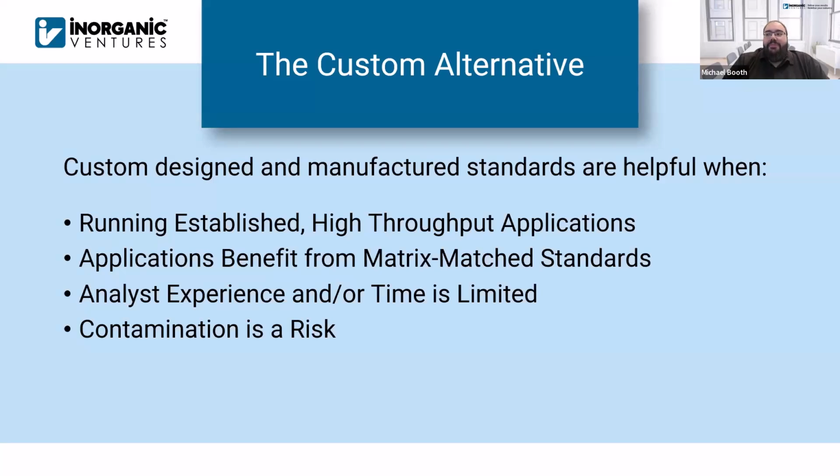Sergey also mentioned matrix matched standards, and this is also extremely important. This is where custom standards can come into play. We can put together standards that are matrix matched to these high concentration elements that might be in your matrix, and we can ensure that those standards are also clean of impurities. So that's really the biggest part. We've talked to a lot of folks that have put together matrix matched standards from stock standards, using maybe a salt or something like that to do the matrix matching. But you have to worry about the purity of those materials that you're putting in the solution because it can impact the accuracy of your standard and thus the accuracy of your analysis.